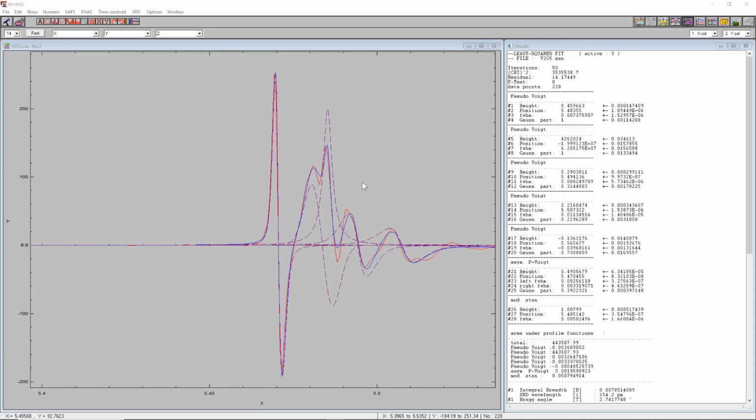Apparently, so far we have not talked about number of independent parameters, confidence limits, and statistical significance of the parameters used in this refinement. This is a rabbit hole I do not want to go down now, but we will have to talk about this when we are looking at the XAFS refinement, and all the things that we are going to say there, of course, also applies to profile fitting in the XANES region. So a simple but stable procedure is recommended.